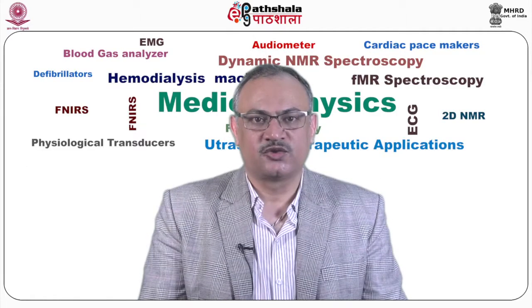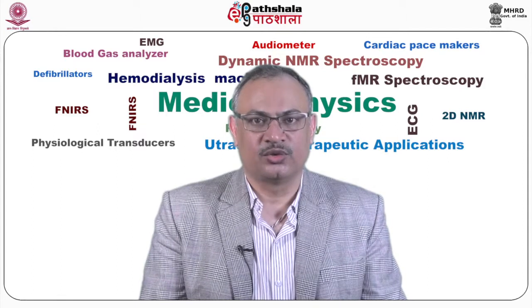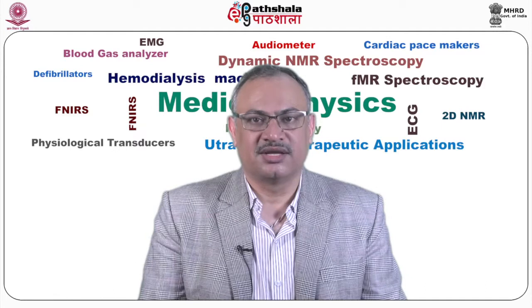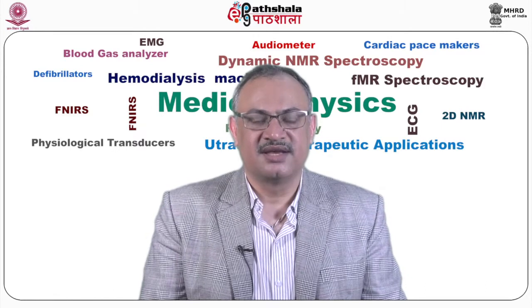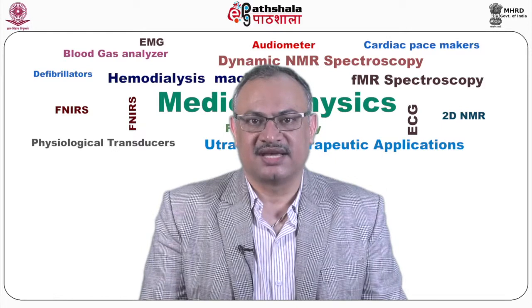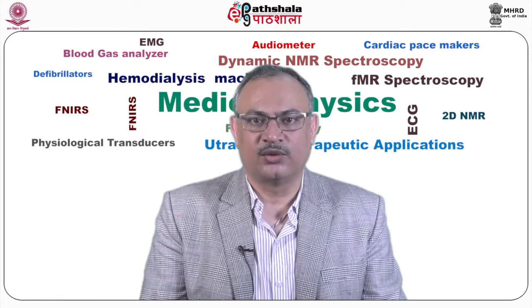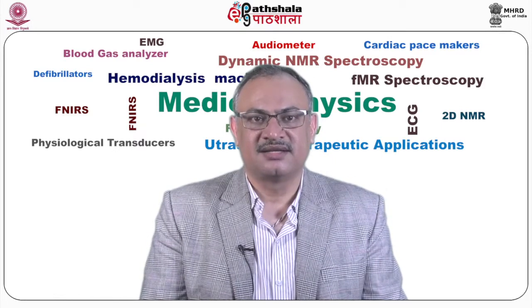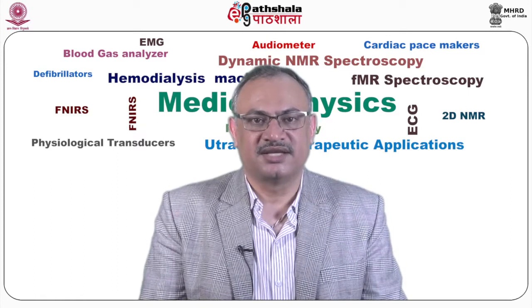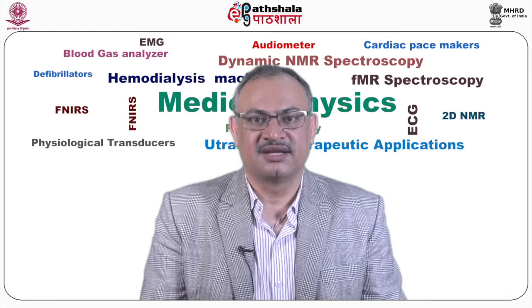If the pulse rate is too fast, spin lattice relaxation cannot restore the population difference between the ground and excited states. Consequently, the net magnetization along the z-axis prior to each scan drops with each successive scan, and the population of the ground and excited states may become equal. This is referred to as saturation of the transition.